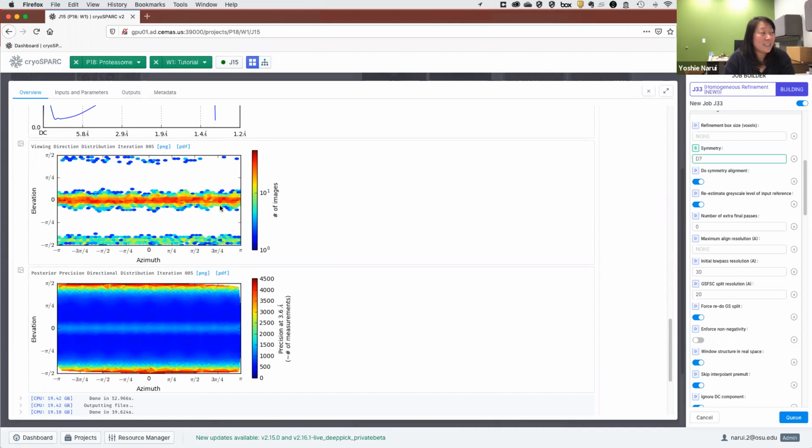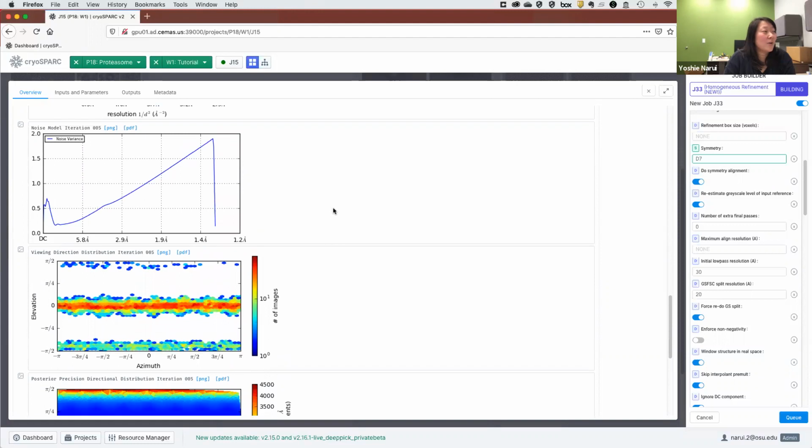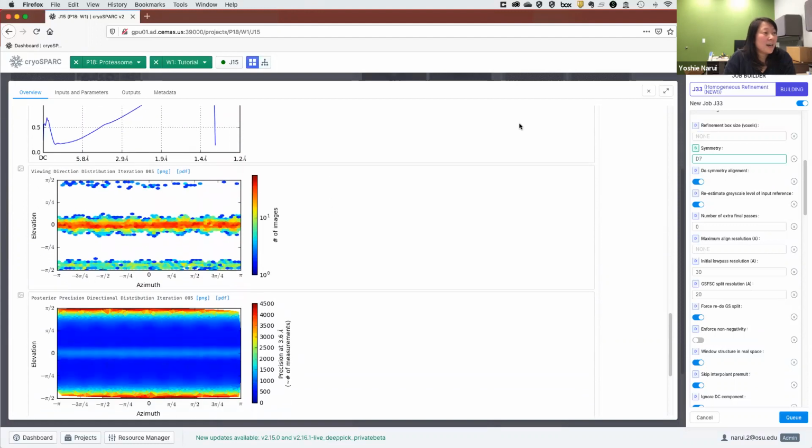So this does cover a broad range, but if you have a preferred orientation problem, you're going to have very local hotspots, like tight spots, and you're not actually going to be able to even build a model. So it depends on your data. If you had several hotspots, would it be acceptable? It depends what your model looks like.